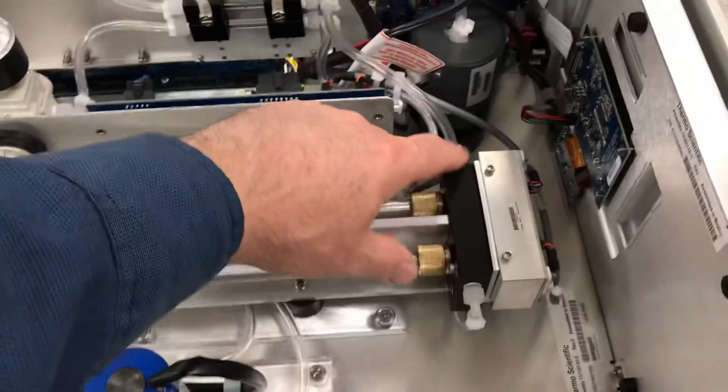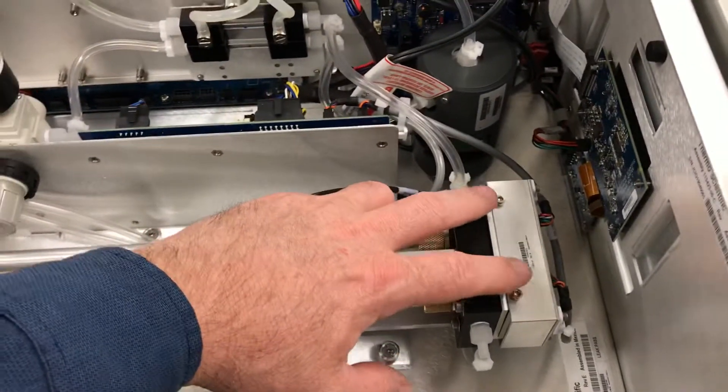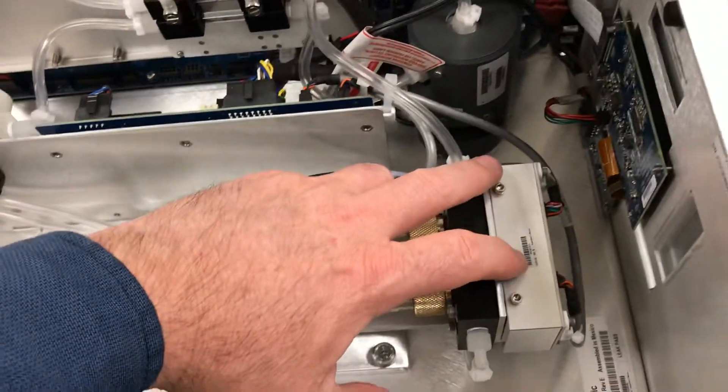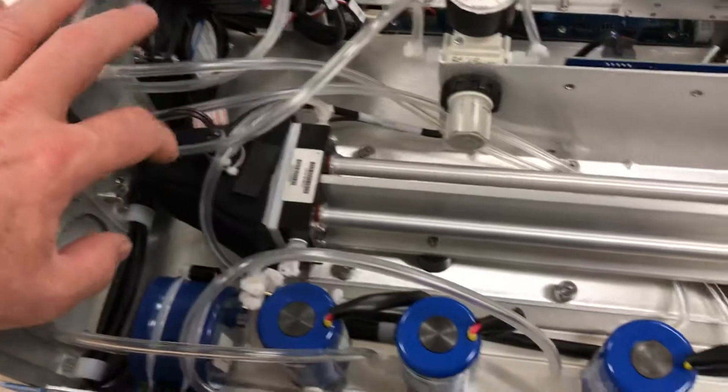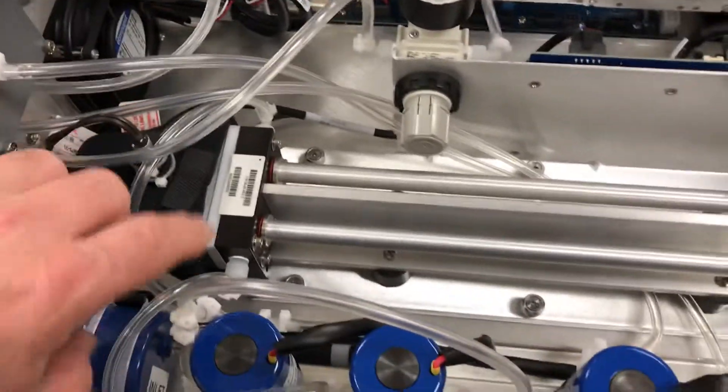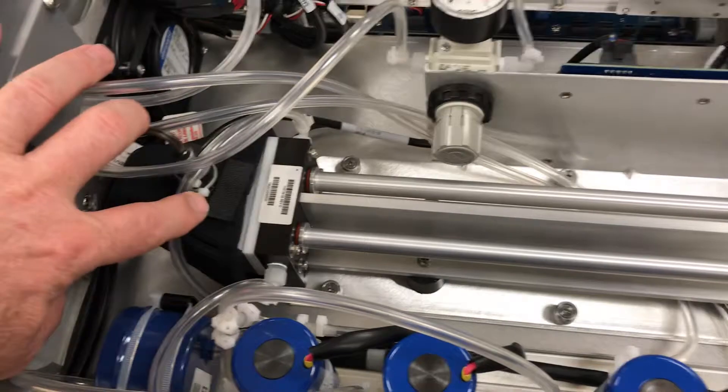The detectors have been changed a bit. You can see cell A and cell B detector is a modified block right here. On the back side, you've got the light intensity lamp that sends light down both cells for ozone detection.